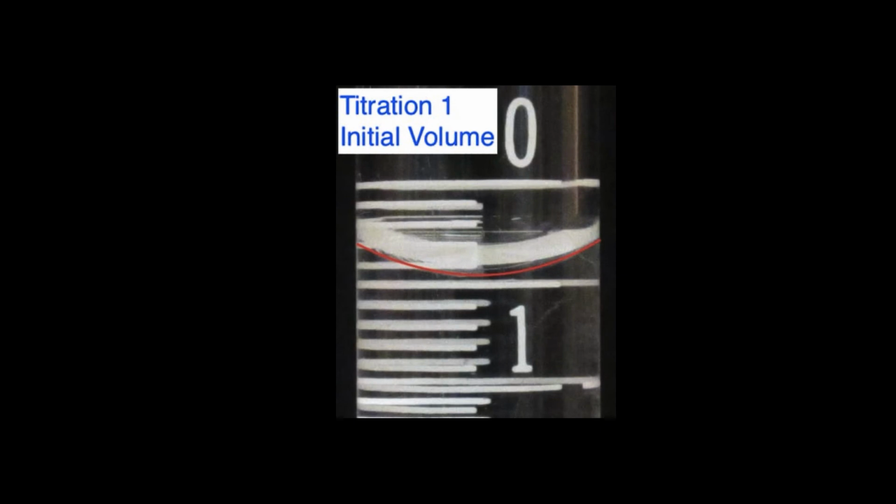Okay, so you're going to be recording to the 100th position for each volume measurement in a titration. Remember, typical procedure for measuring from an analog scale, which is what we have here, you're going to estimate the next digit down from the markings on the Buret or graduated cylinder, whatever you're using. And since each mark is at 0.1 milliliters, that means you can estimate the 0.01 position.